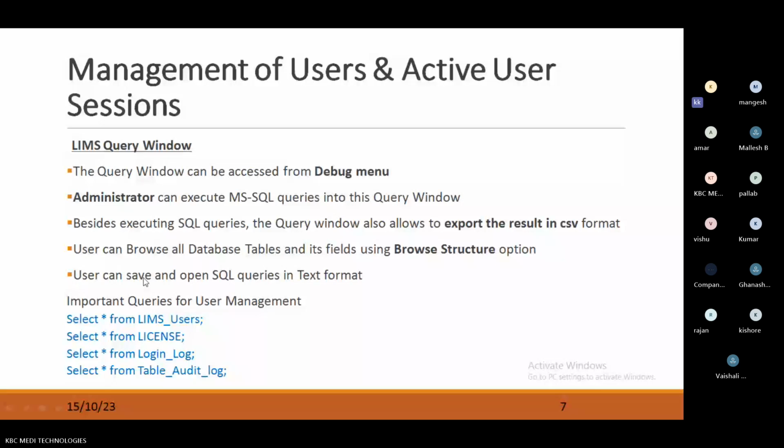And apart from this, this is related to query windows. With this query window, LIMS basic coding will start. Those who know SQL can understand easily. Even otherwise it is not a big deal, you can understand easily once you are aware of analysis and product preparation master data.